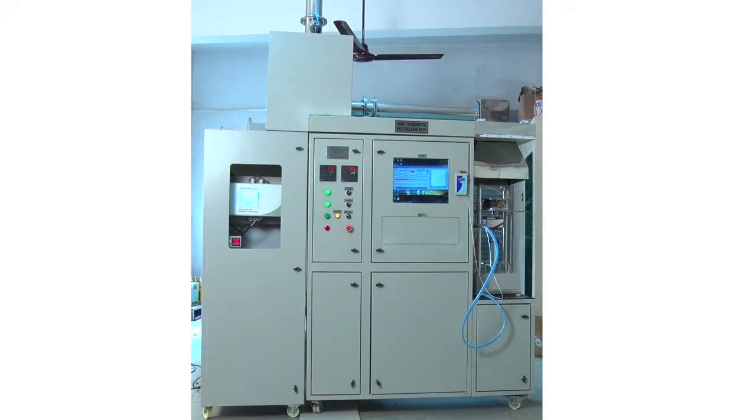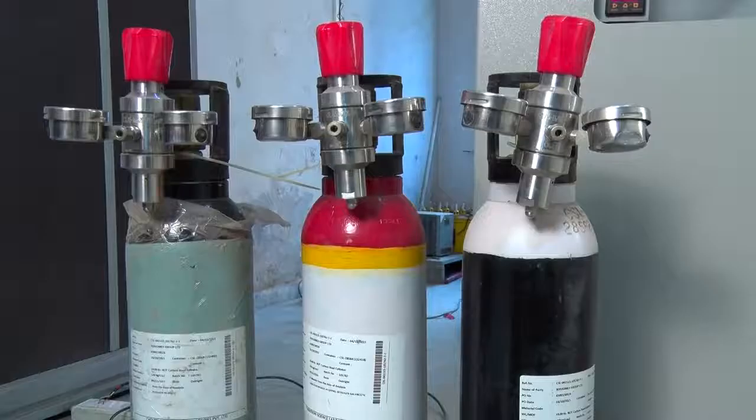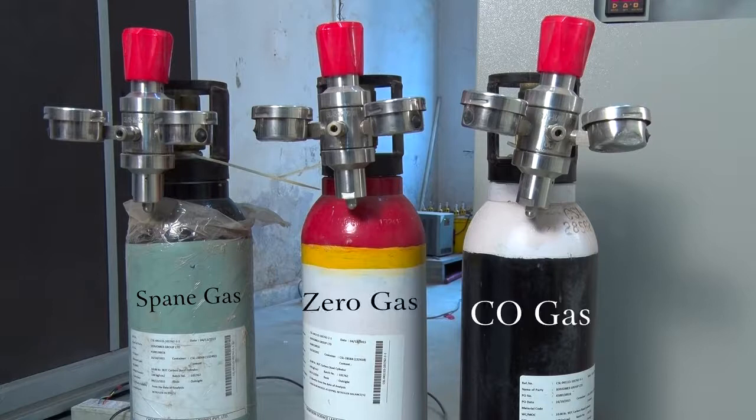Now for the calibration part — first, the analyzer. Before doing a test, we have to calibrate the analyzer using 3 gases: the Span Gas, the Zero Gas, and the CO Gas.